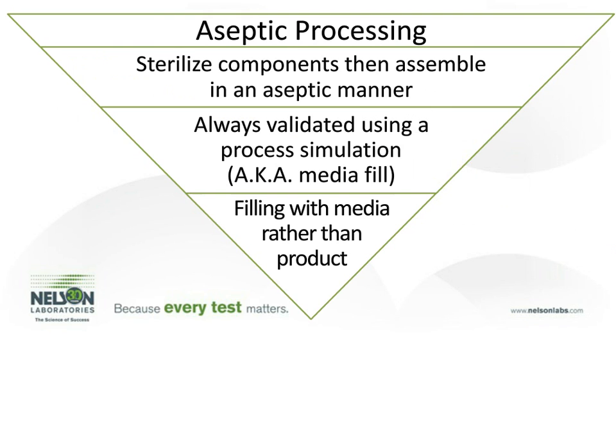Now, when we're talking aseptic processing, it's very different. Here we are sterilizing the components in their own bags or containers, and then we are assembling all of the components in an aseptic manner. And this type of process is always validated using what's called a process simulation, also known as a media fill.